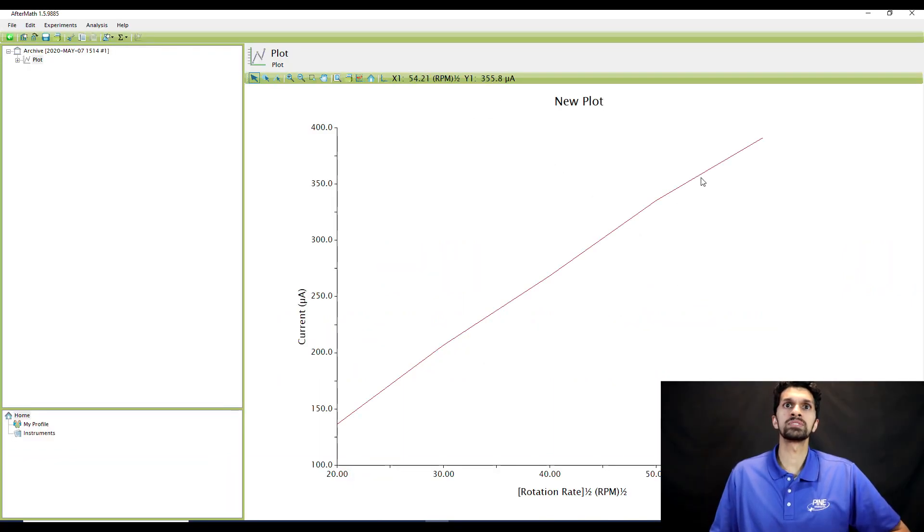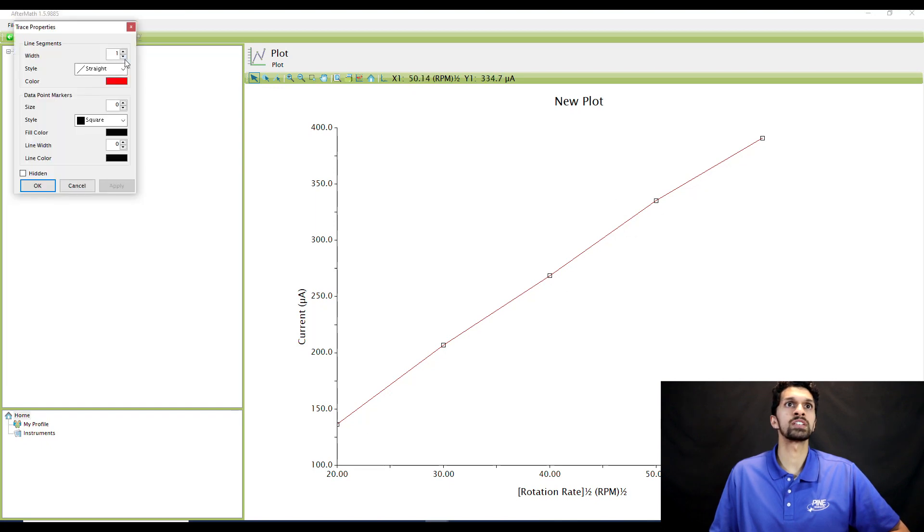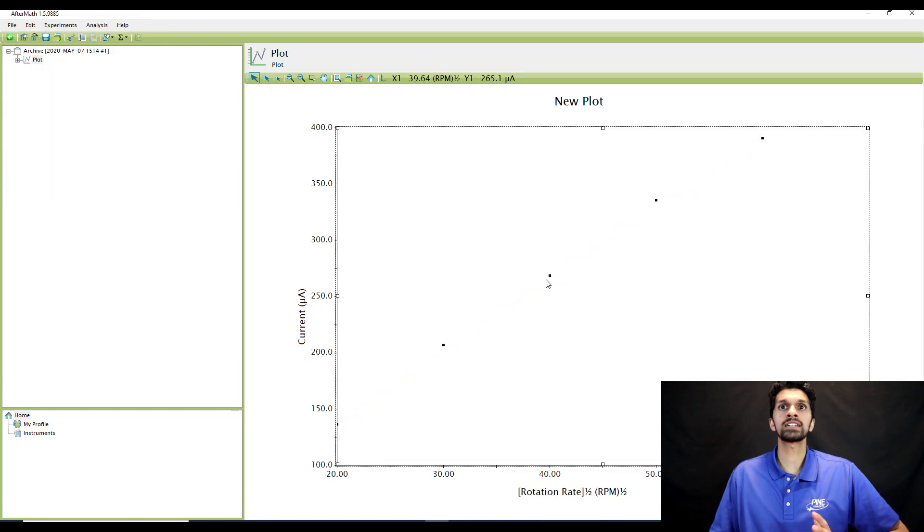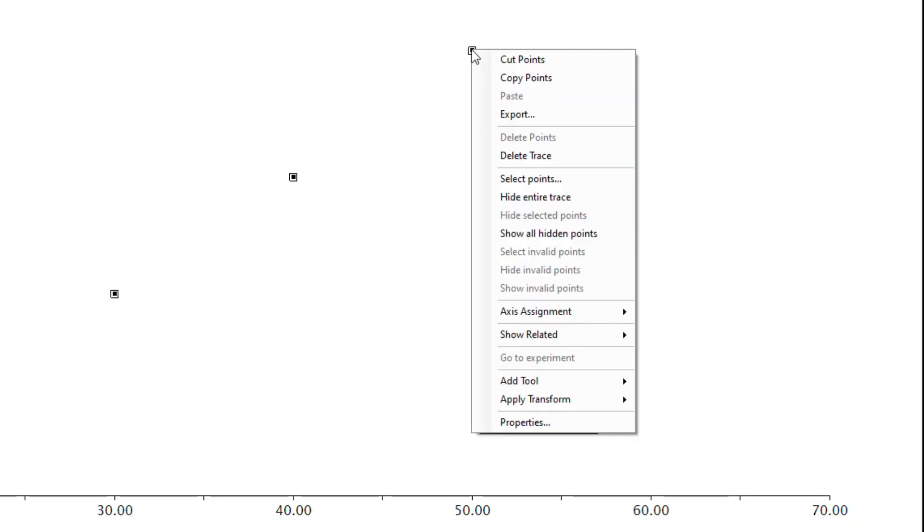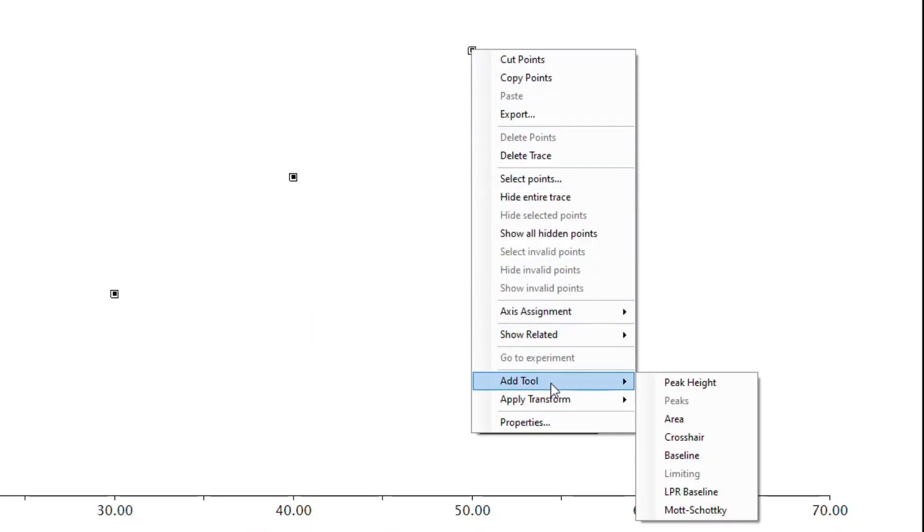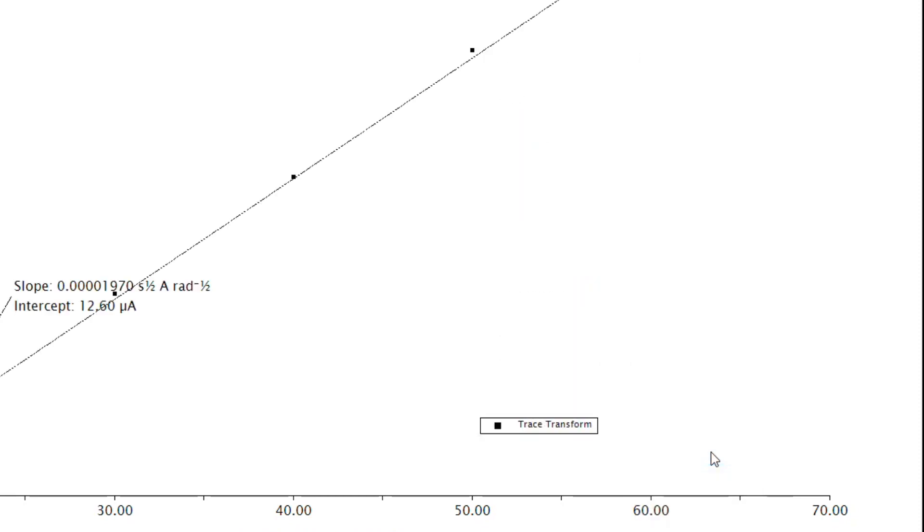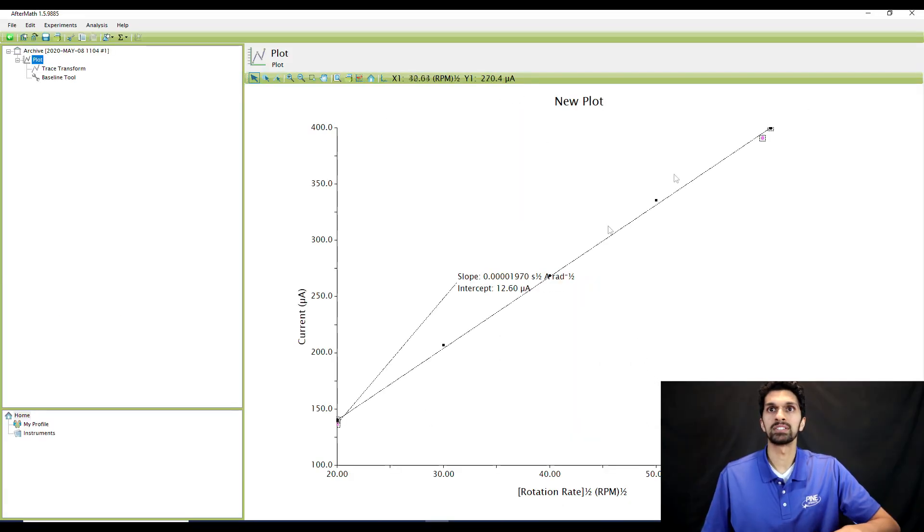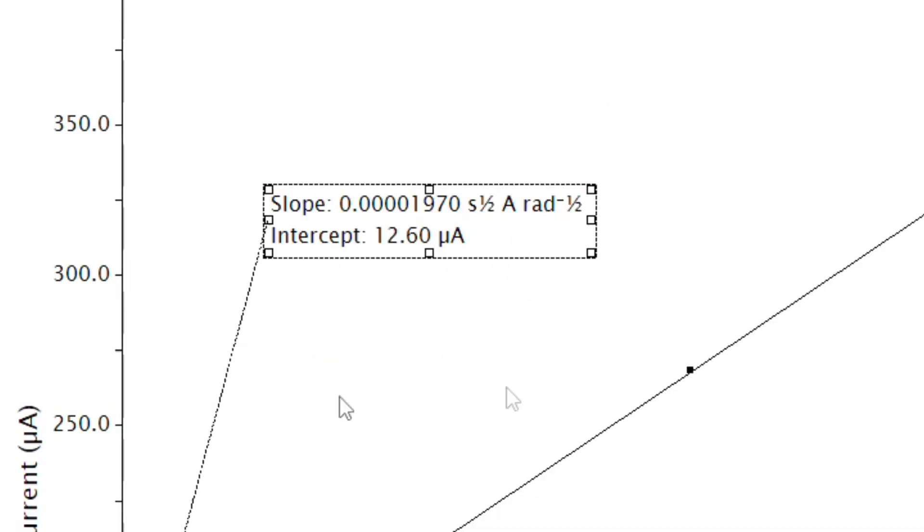All right, so all of these data points here are actually connected by a line by default. I just want to change that. It'll be a little easier for you to see the individual data points. And now the next thing I want to do is to perform the linear regression. I am going to actually use the baseline tool. So I'm going to left click on the data points, right click, I'm going to add tool, I'm going to hit baseline. After I hit baseline, it creates this linear regression. And over here, you can see it gives me the slope and the y-intercept.